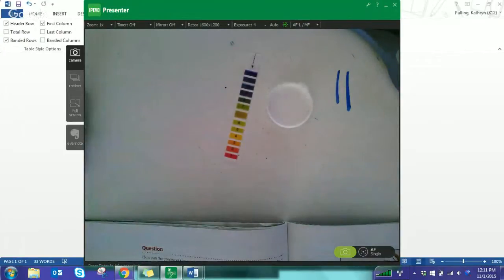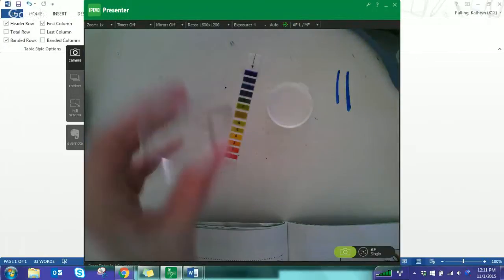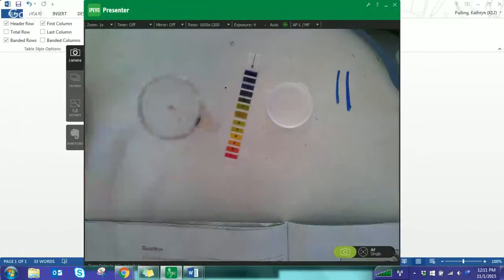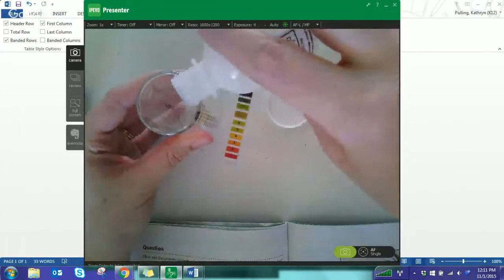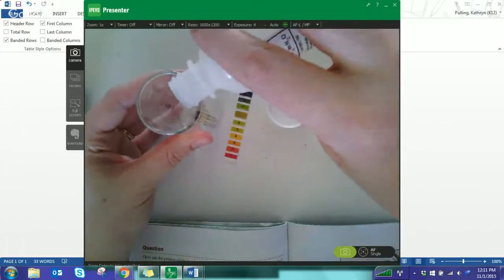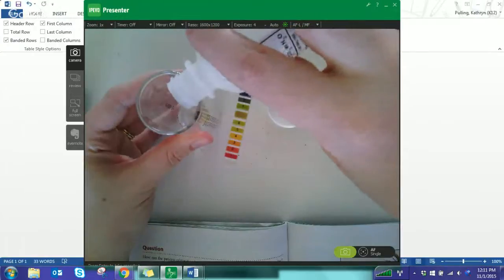So I have enough of the solution A. I'm going to quickly start over again since I might have accidentally added too much titrant low at the beginning because I got 2 drops in instead of 1. Luckily, I have enough to do that.